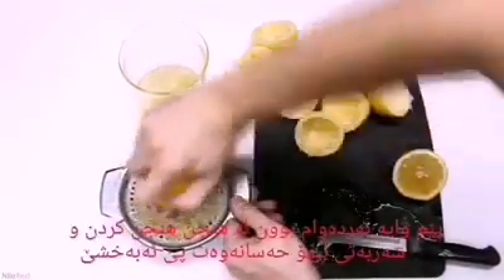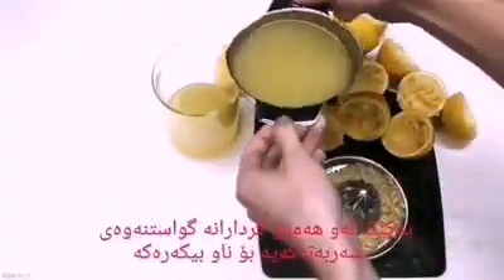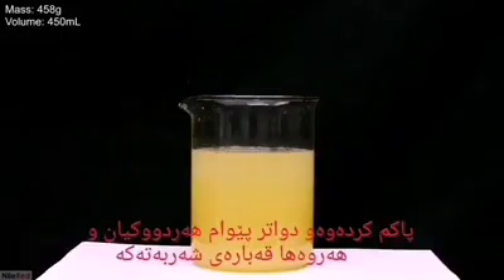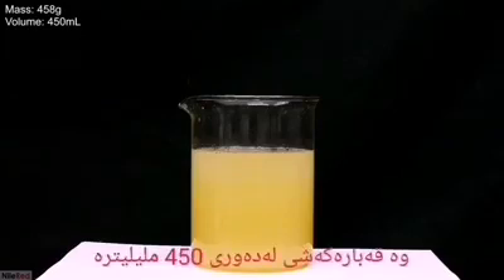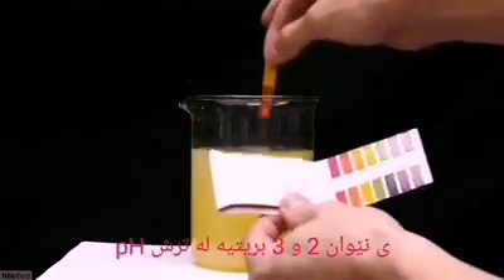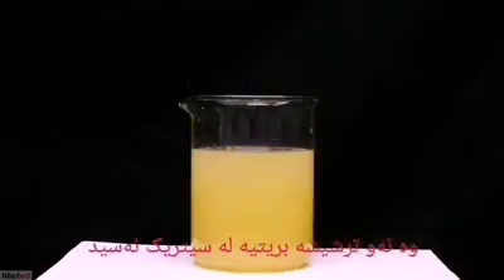I then continued by chopping up and juicing the rest of the lemons. Once they'd all been processed, I transferred the juice to the beaker. I measured both the mass and the volume of the juice — the mass came out to be about 458 grams and the volume was about 450 milliliters. Using some cheap universal pH paper, I see that the pH is hovering between 2 and 3, which is mildly acidic, mostly due to citric acid.